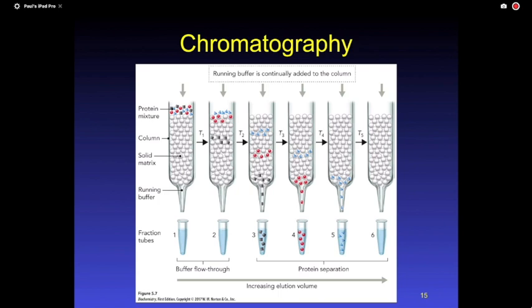Those spheres will be coated, and they're very tiny because the smaller you have, the more surface area you have. And we use polymers of sugars, really, and then we coat the outside with certain things, or we do have those pieces of sand that might have holes in the interior, depending upon what we're doing.